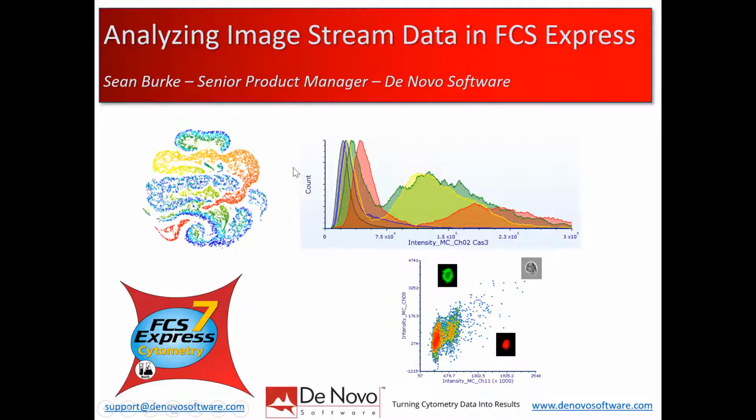Today we're going to be talking about loading in and working with Amnis image stream data in FCS Express 7. My name is Sean Burke, I'm the Senior Product Manager at DeNovo Software, and I'll be guiding you through the webinar today.